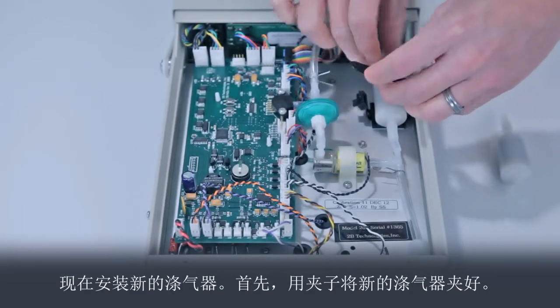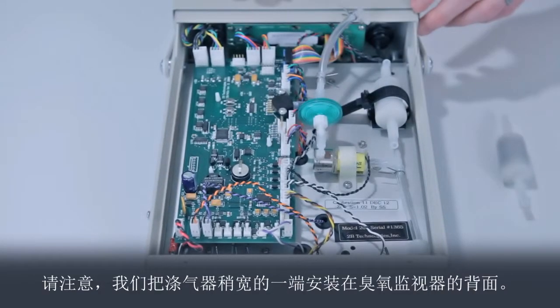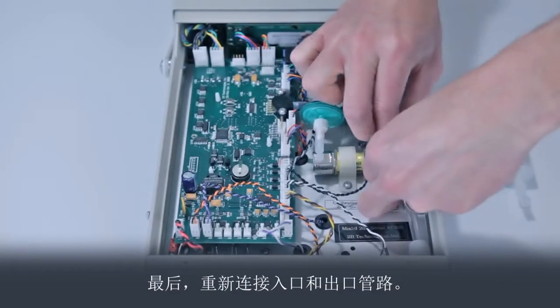Now, install the new scrubber. First, clamp the new scrubber in place. Notice that we installed the scrubber with the slightly wider end toward the back of the ozone monitor. Finally, reattach the inlet and outlet tubing.